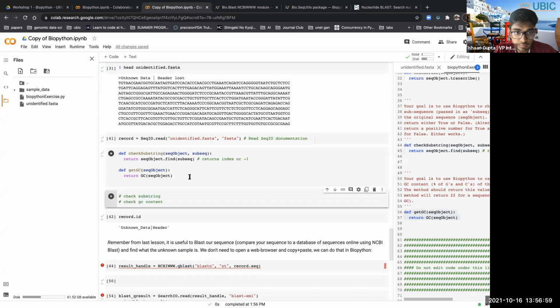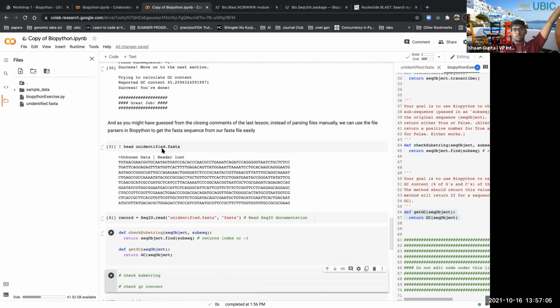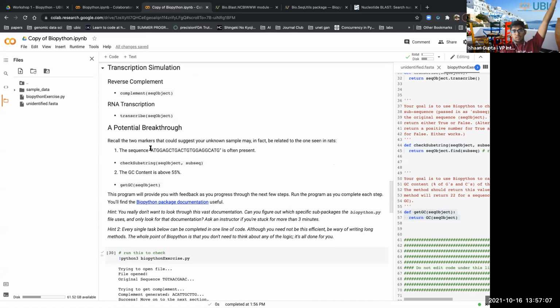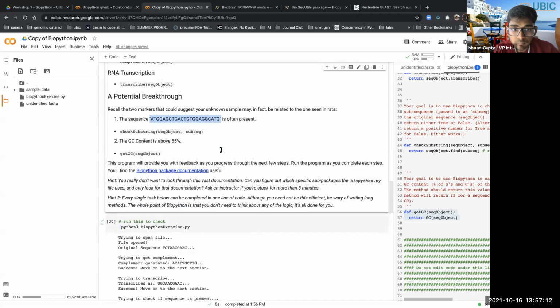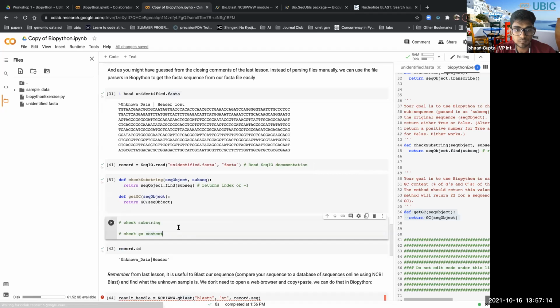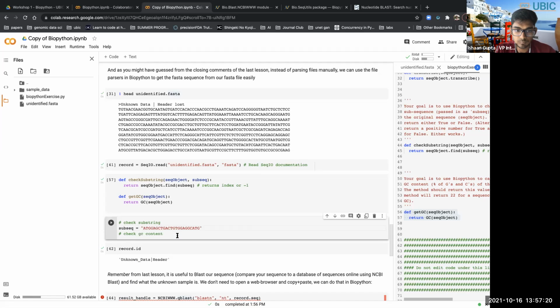And then I can run this. So let me know, what do you get? Do you find the substring here? What's the GC content? Let's see who gets that first.